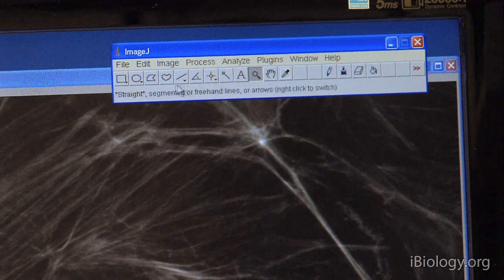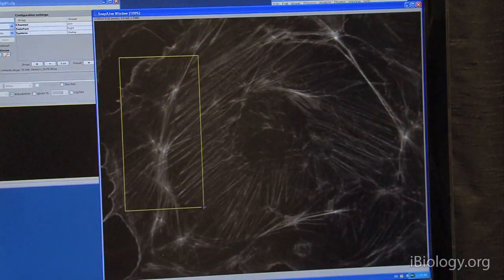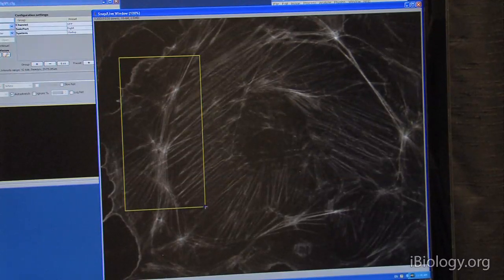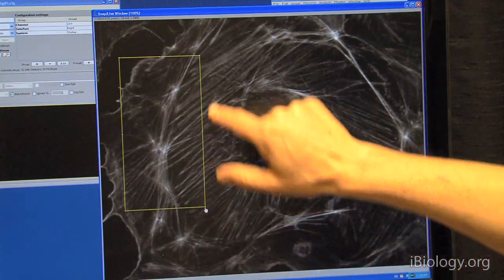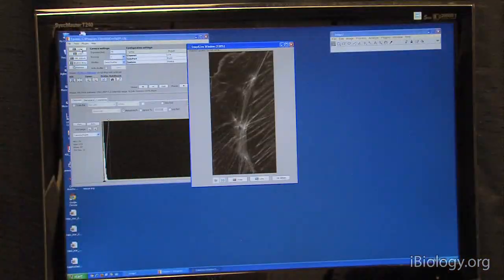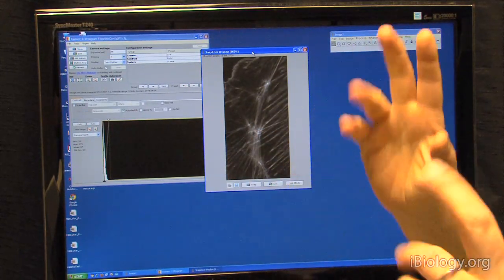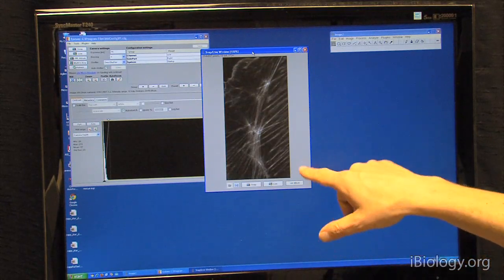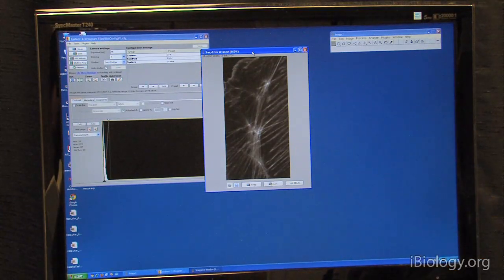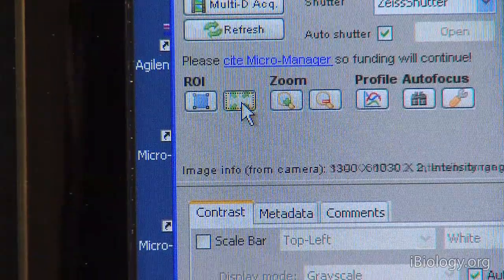Then, also, what often happens is that we're not interested in the whole image, but only in a small region of it. Let's say this is what we really want to follow. I can use the ROI tool. We only get this small region. So, the camera can also read this out much faster. And so, it's always helpful to use an ROI whenever it's applicable. Now, to go back to the full frame, we use the button next to that ROI and snap an image.